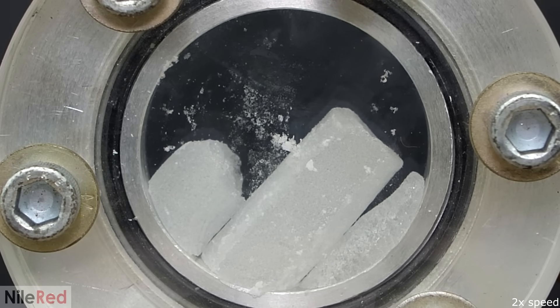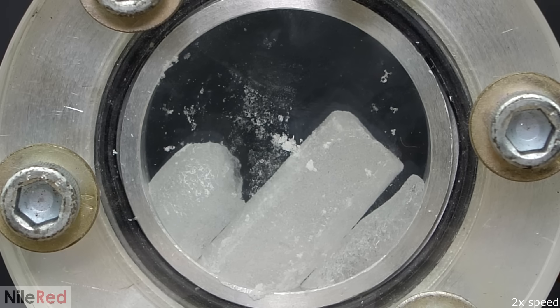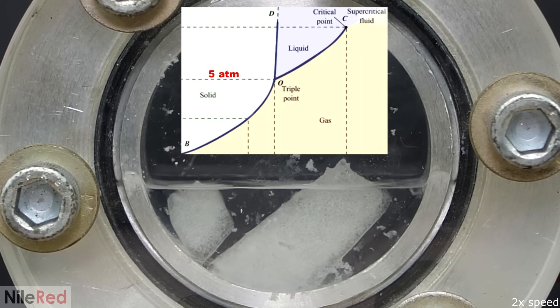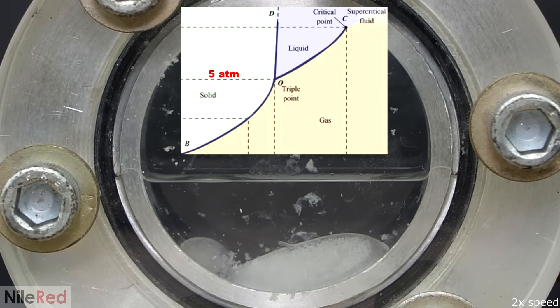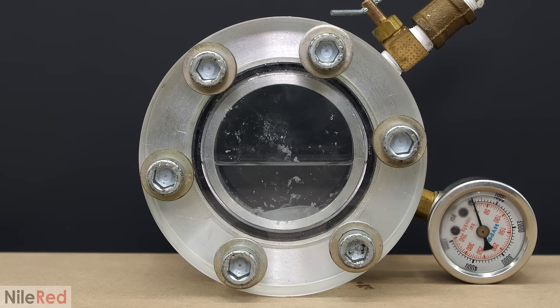Now I had a much better idea of how much to tighten everything, so I did a third run and it all worked. I closed the valve, the pressure started increasing, and the dry ice melted. Under normal atmospheric pressure, carbon dioxide can only be a solid or a gas, but at higher pressures it can also be a liquid. Looking at the CO2 phase diagram, liquid phase only starts to appear at about 5 times atmospheric pressure. Eventually, when the pressure built up to about 5 atm, it all started melting — but one major problem was that the pressure gauge wasn't moving at all, even though the pressure was clearly increasing.